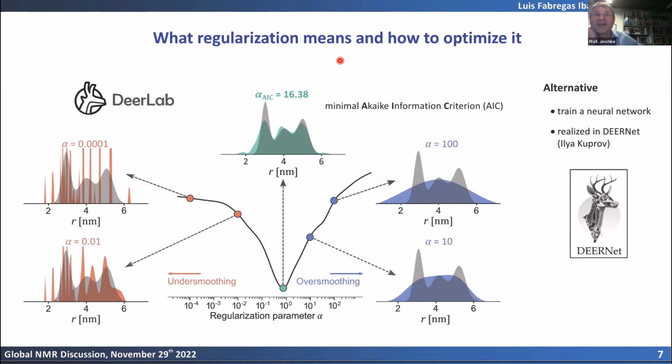So basically, again, I have to say we don't have a complete error estimate at the moment. We say these errors of the spin label positions will contribute to the uncertainty of our ensemble model. What we know for these broad ensembles that we have is that the 3 angstrom is much smaller than the distribution of the conformations.